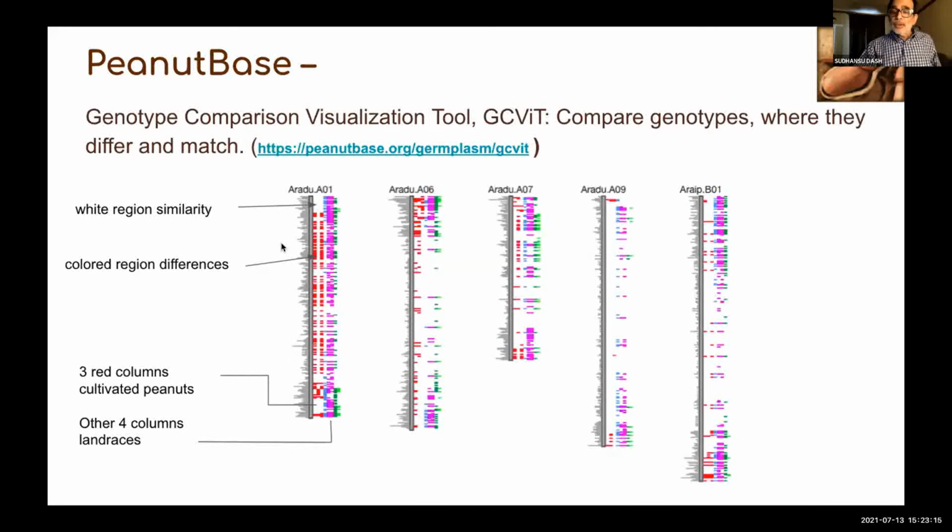And I know some people have started with this to narrow down from these bird's eye view features to reach the genomic region where they can see what the genomic features are, particularly the molecular markers they can use. And we hope this becomes useful to the community later.